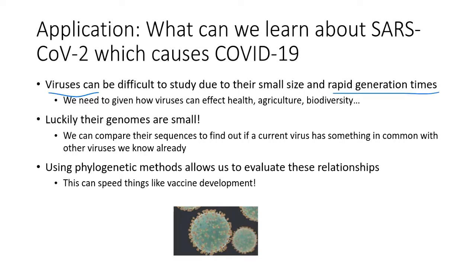But the genomes are small, and in a professional research setting, those are actually complete genomes that are going to be compared. What we did, we trimmed those genomes for you. You're going to use only one gene, RNA-dependent RNA polymerase. I'm going to type it right here.